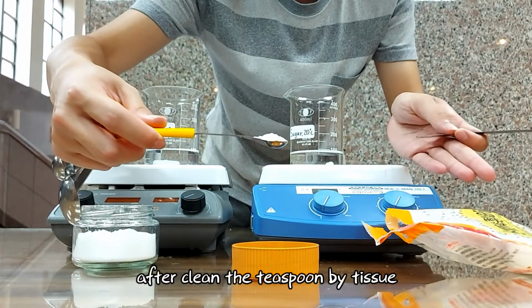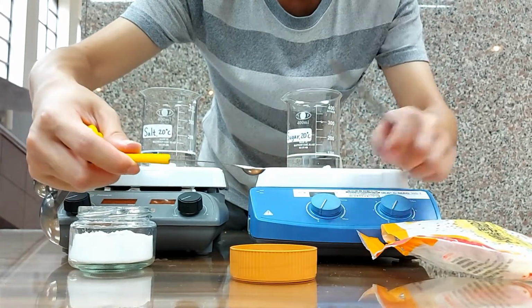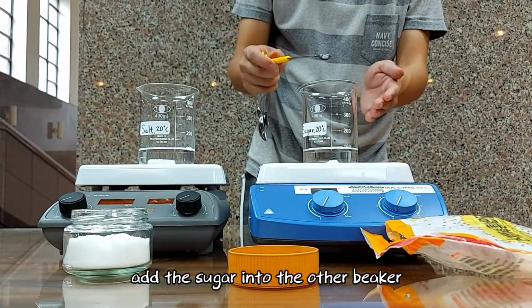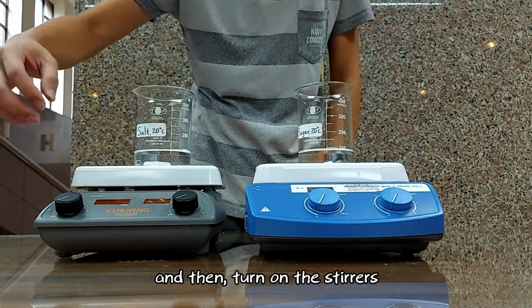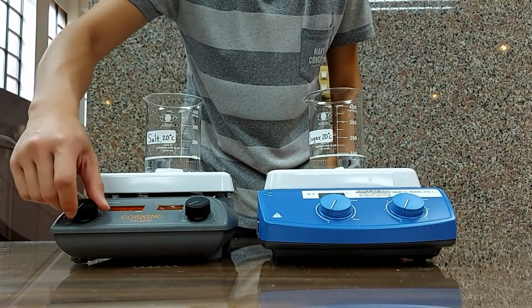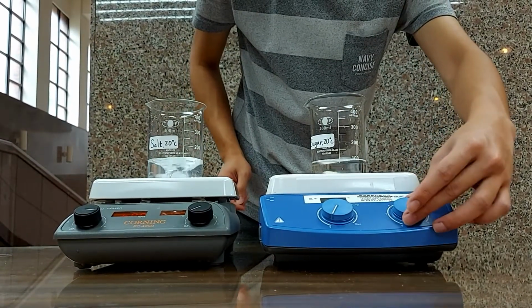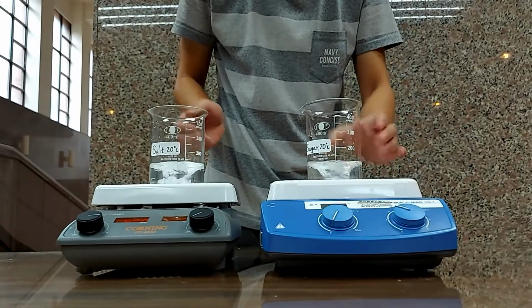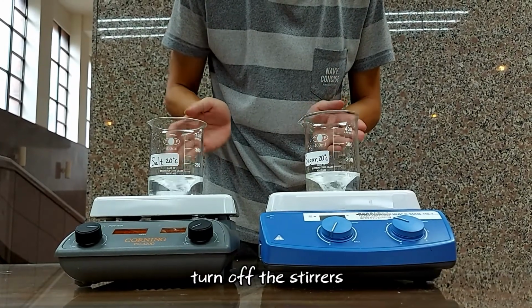After cleaning the teaspoon with tissue, use the same way to make 1 level teaspoon of sugar. Add the sugar into the other beaker. And then, turn on the stirrer. After the salt and the sugar dissolved in the water thoroughly, turn off the stirrer.